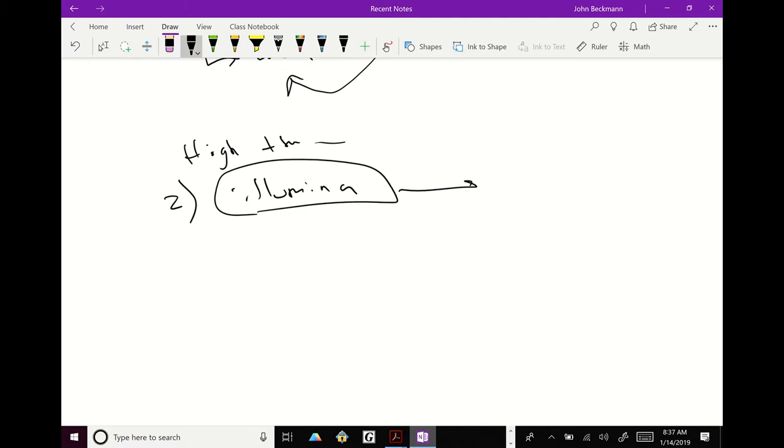With Sanger, you're only sequencing one template. High throughput is for sequencing millions of templates, different templates, at the same time. So that means this is for sequencing genomes. Sanger you use for sequencing a gene that you cloned or a PCR product that you're amplifying. Illumina or high throughput you use to sequence genomes, okay?